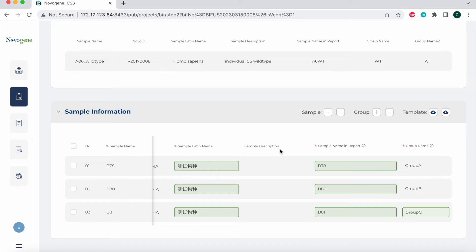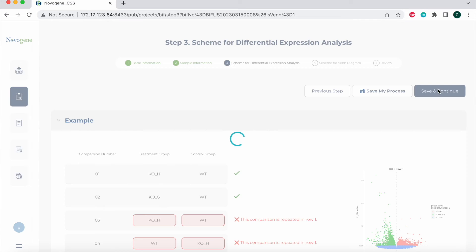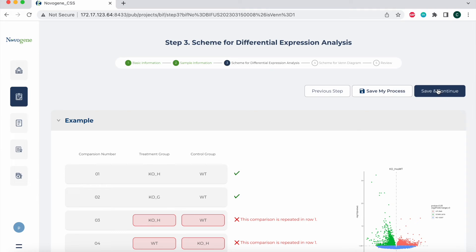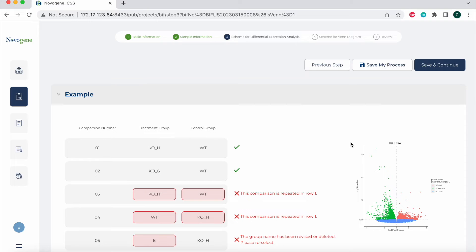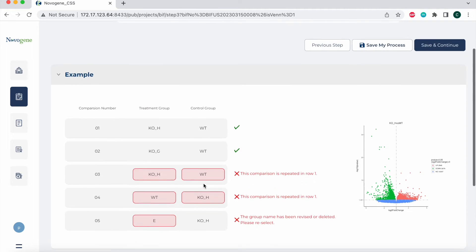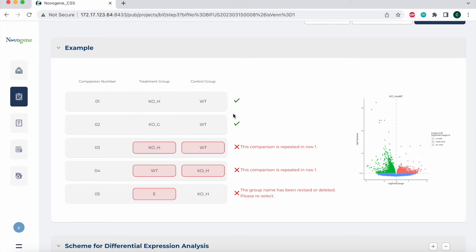After the sample information is completed, you can fill in the scheme for differential expression analysis on step three. So I'm going to save and continue here and move on to this next section. Similarly, we provide an example section of how to fill in the differential expression analysis section. Please note that repeated comparisons are not allowed. If the group name has been deleted, you should also correct the comparison group. Here it shows you acceptable comparison groups for the treatment and control group based off the group names that you just listed on the other sheet. It also shows you three examples that are not supported. This first example is a repeat of the comparison group from number one. The second example is a repeat in the inverted form of comparison group one. The third example includes a group name that is no longer being used on the form.